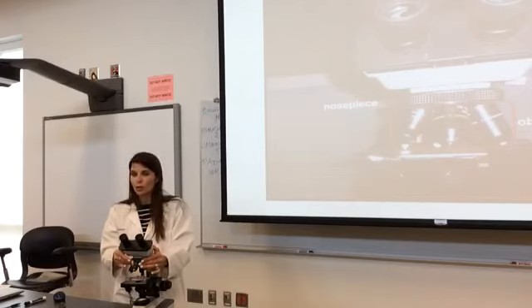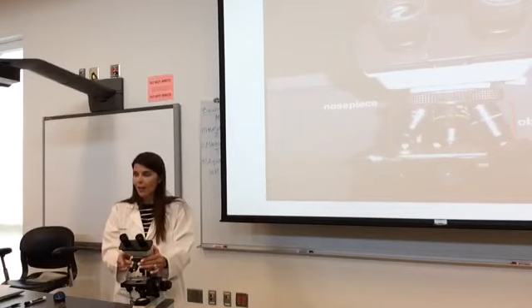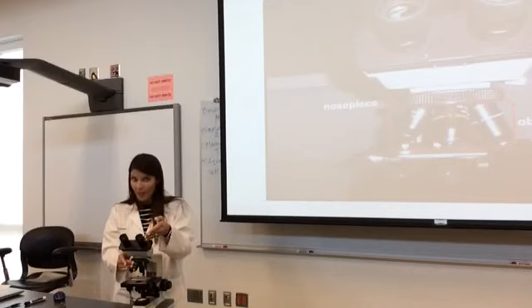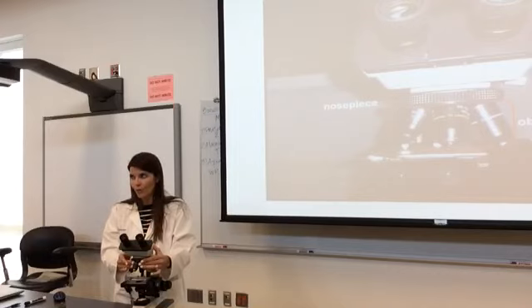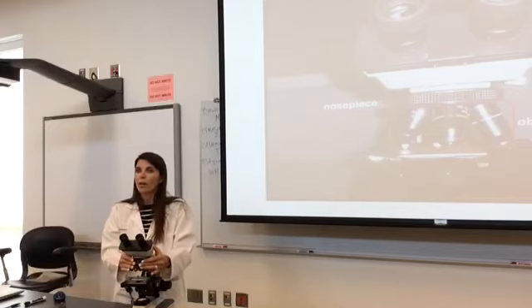And it says 100. This is called the oil immersion objective. When it is engaged, it magnifies 100 times. Then the oculars also magnify 10 times, so it's a total magnification of 1,000. You will not use this objective in this course. Okay? So when I ask you to get it on high power, I just want it on blue.